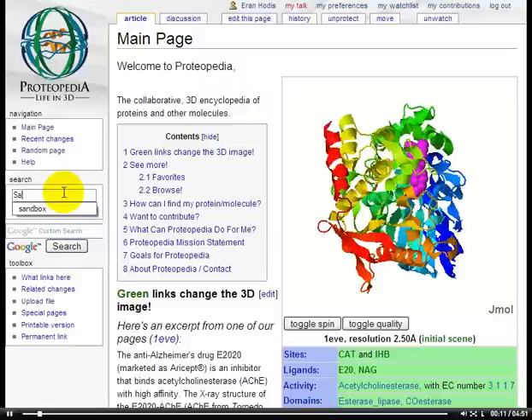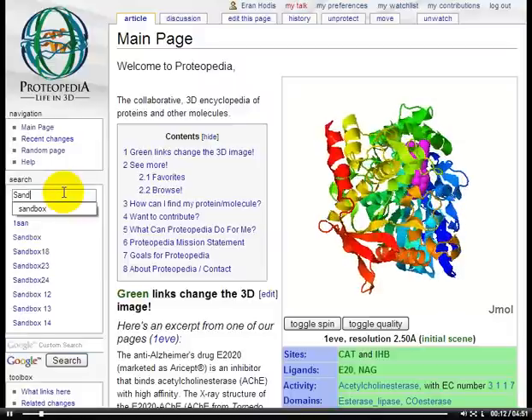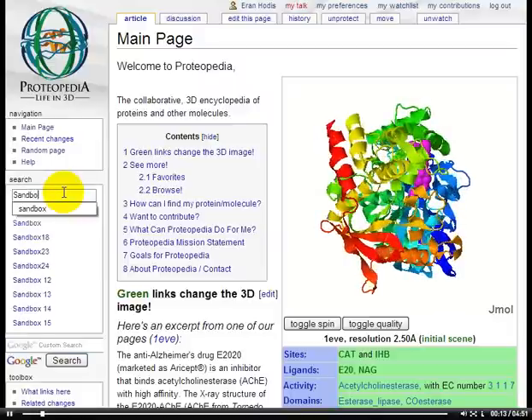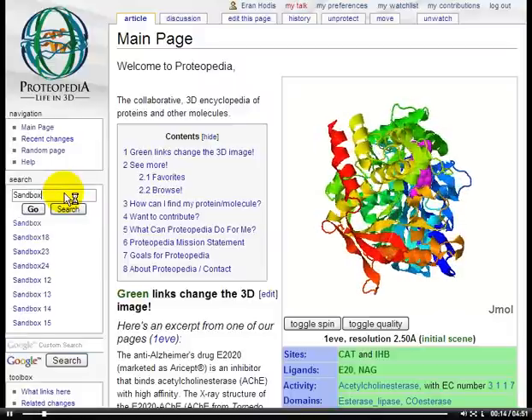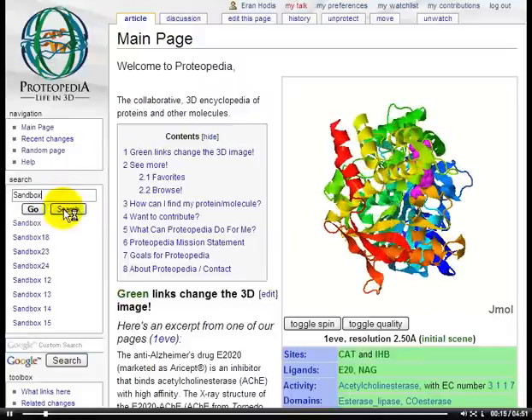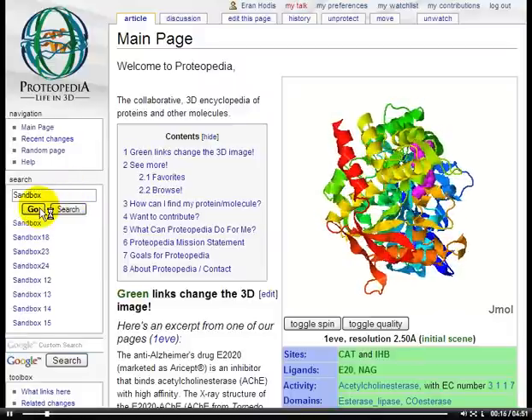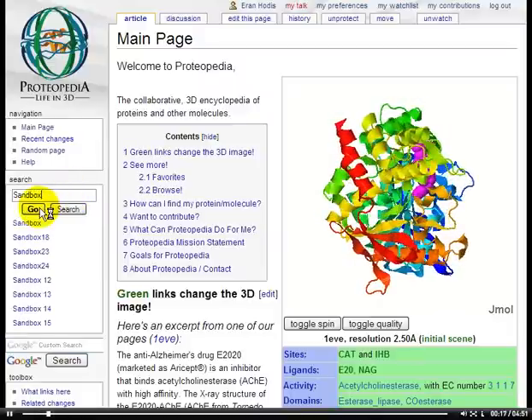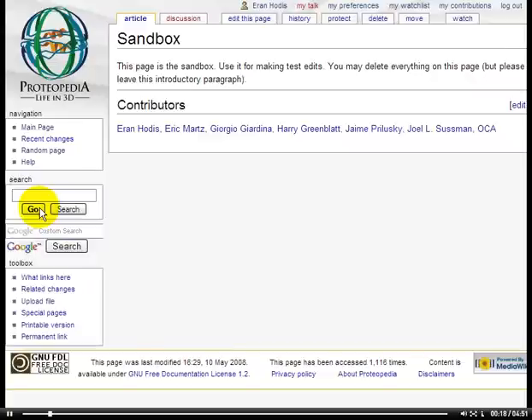Let's go to the Sandbox page. In case you're not already aware, the Sandbox page is a page where you can try out all sorts of edits without worrying that you might mess up an important page.